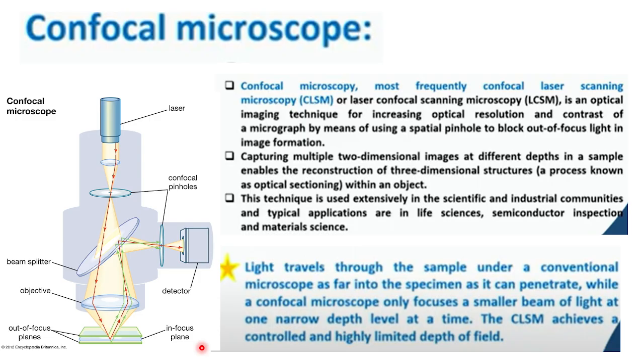So what is the benefit? If it is in scanning mode, it will give you more intricate structure or features, and obviously for that you need a very pinpointed radiation, so that it can interact with each and every point, and after getting the signal from each and every point you will prepare the image.